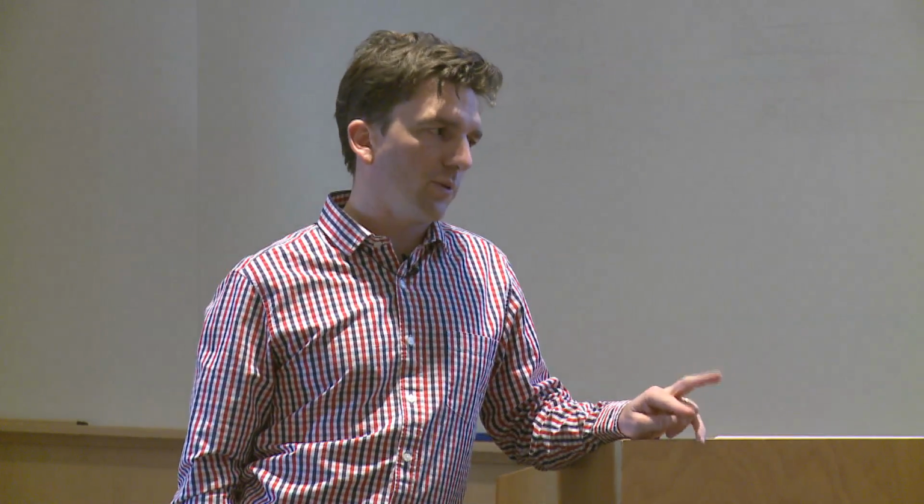Can I ask a question about this? Yeah. If you make a limit of, let's say, 10 or whatever that limit is, does it mean that anything that maps to more than 10 will be thrown away, or does it mean that all the first 10 are kept? Those are the two possibilities. Both are possible in TOPHAT.